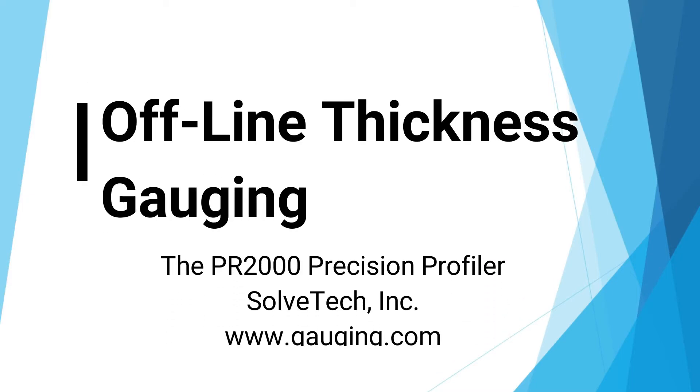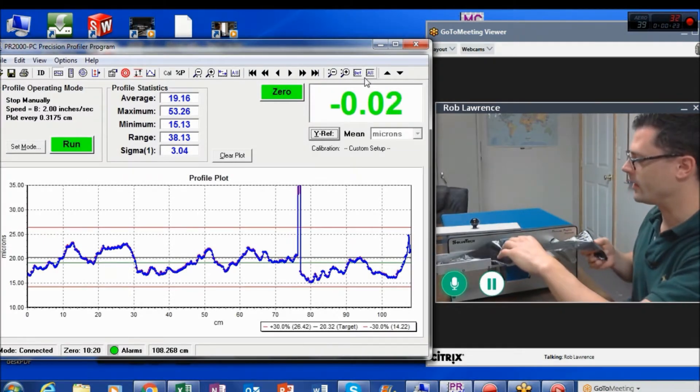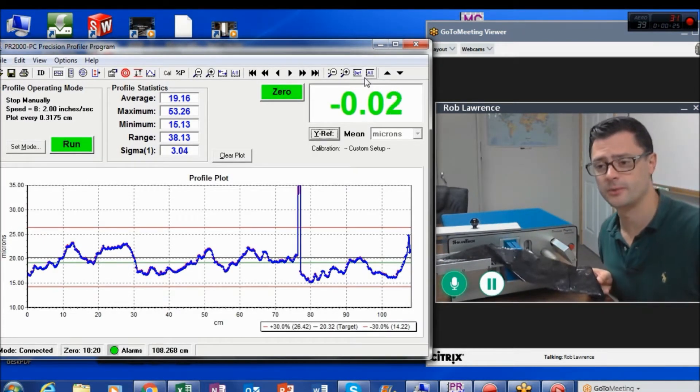Hi, this is Rob Lawrence from SoftTech, and I'm here to introduce you to the PR2000 Precision Profiler. This is the world's leading thickness profiler due to its precision, accuracy, and repeatability.